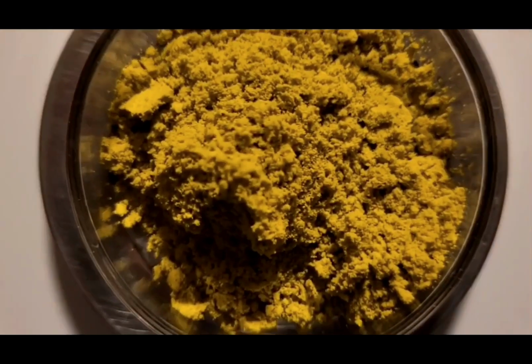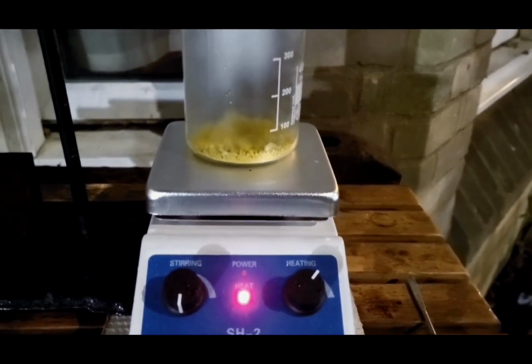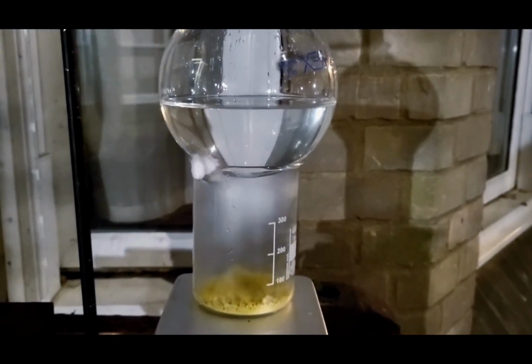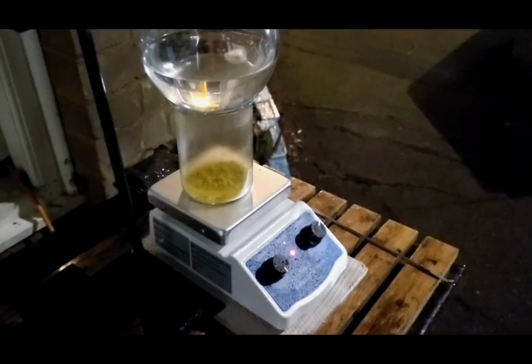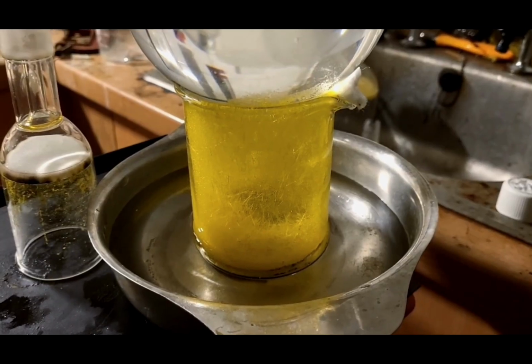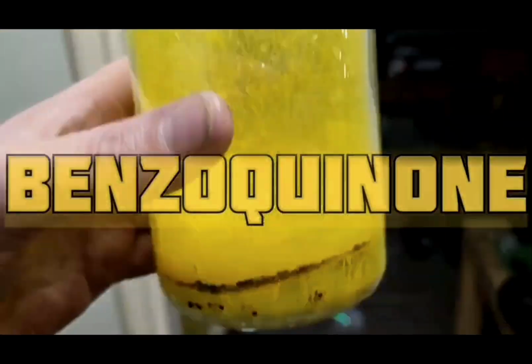To obtain pure benzoquinone, we perform a sublimation. By heating our crude product, the benzoquinone sublimates and we can collect a crop of crystals on a cold surface. This wasn't done perfectly, so there was some product loss.